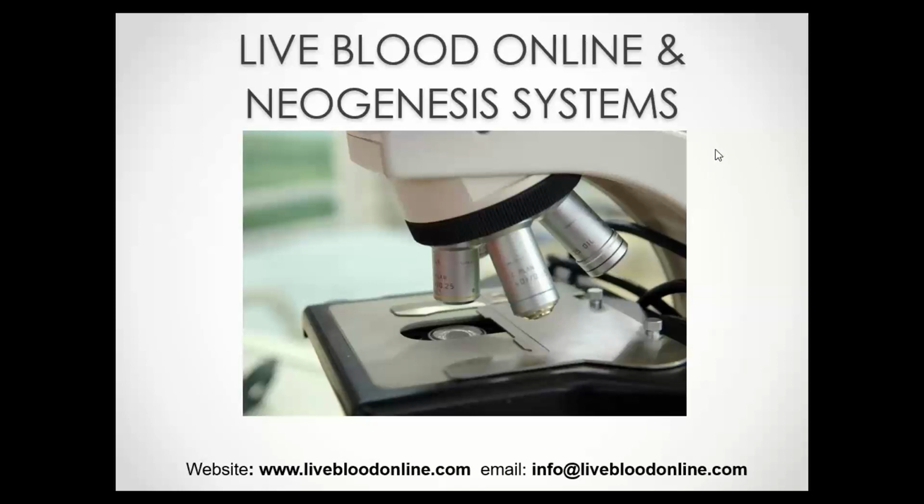Okay, so this relates to the reliability or repeatability of the test. Some people who are skeptical of live blood analysis mention this as one of the potential problems with the test. That there are many factors that will affect the outcome of the live blood test, which may then mean that a patient's results will vary dramatically from one day to the next based on what they had to eat, when they ate, and how much water they drank, for example.